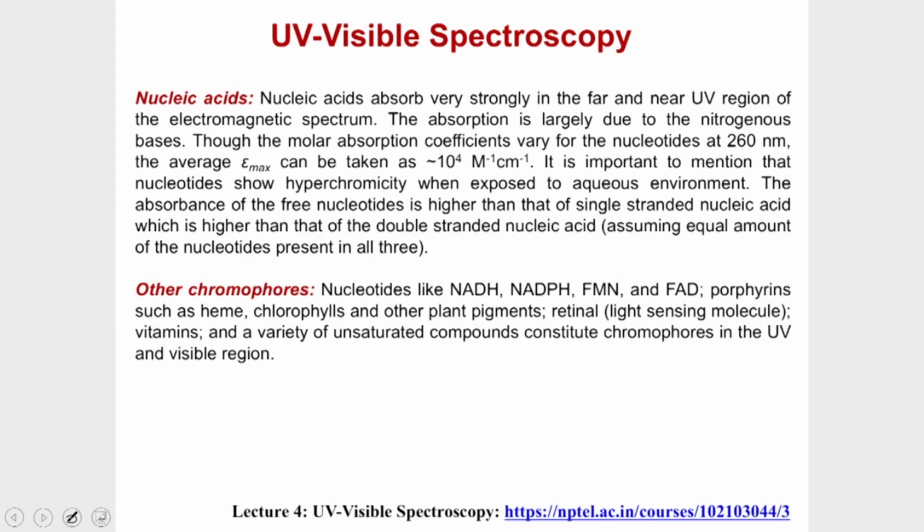Because of this hyperchromicity, which means an increase in absorbance, the phenomenon is used to follow the unwinding of a DNA molecule, because once the DNA unwinds, the nucleotides get exposed to water and give you higher absorbance.